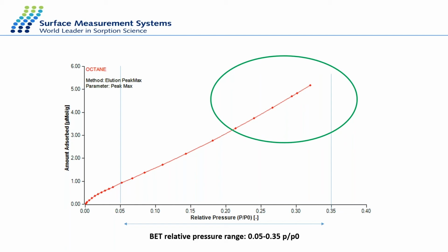In this case, I just stop the experiment and change the sample ID, because probably I underestimated the BET specific surface area of my sample. So using a higher BET surface area, then rerun the method, and I will probably get higher relative pressure points.